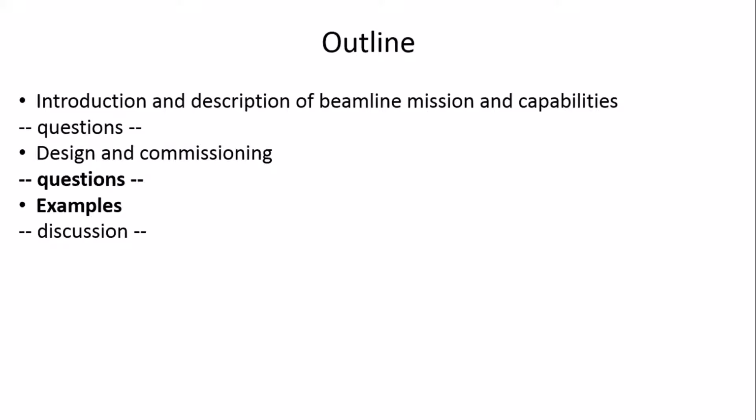Another question has to do with the XAS mode, or as I think you were calling it, energy scanning mode. I find that if I do point-by-point XAS, something's moving around such that the data are generally noisy, but doing it in XAS mode averages that out. The problem we were having on 1032 is that it was hard to synchronize the crystal translation, the crystal gap, with the energy scanning. And down there at the phosphorus edge, the beam height is definitely not fixed unless you do that. So I was wondering how you do that.